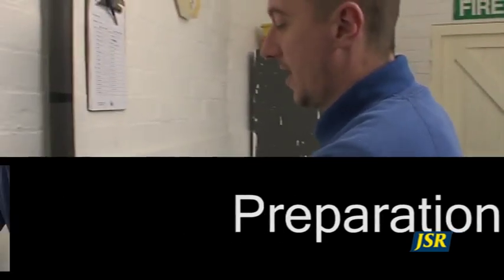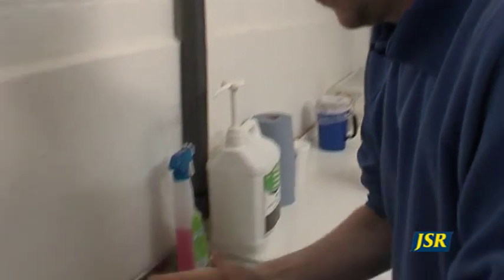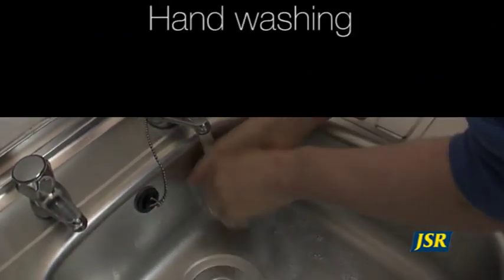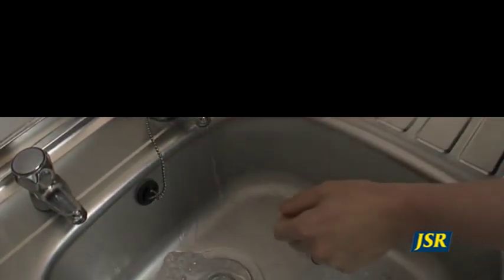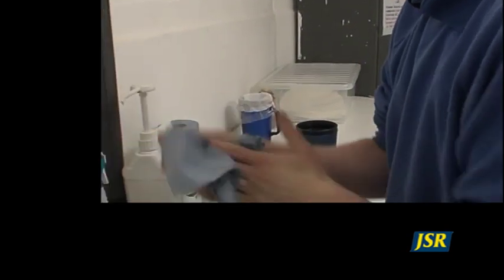Hygiene is essential when collecting and processing semen. You should always wash your hands before preparing any equipment for collection, using an antibacterial gel soap and warm water. Dry them with disposable tissue so as not to transfer contamination from a hand towel.